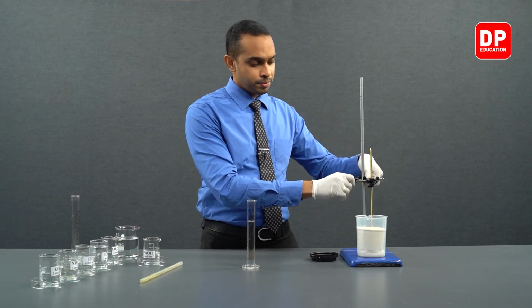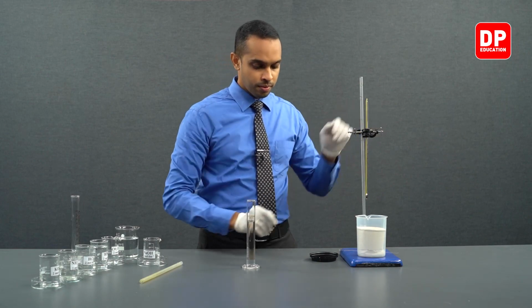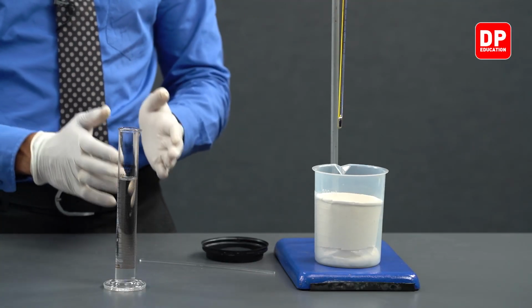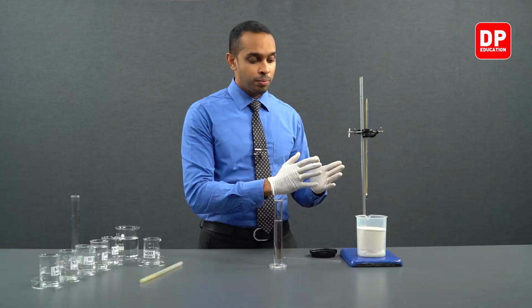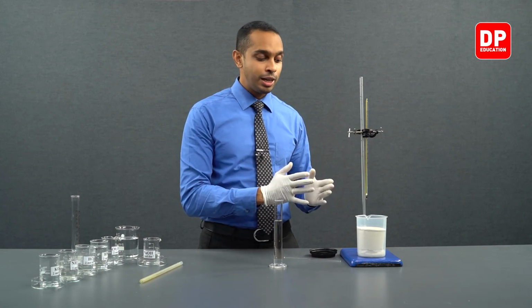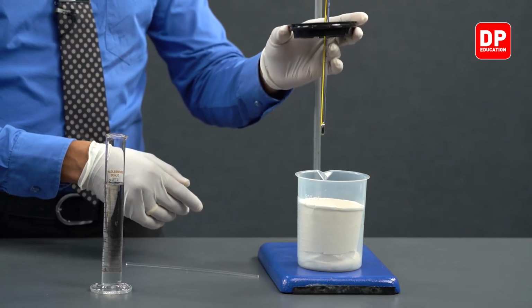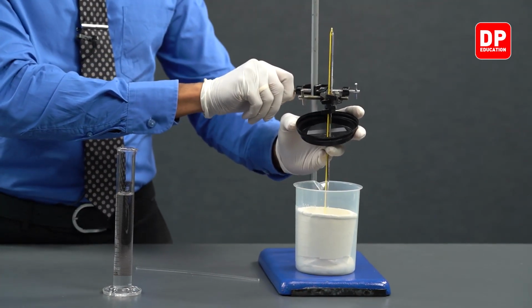We'll lift this thermometer out of the way, and we have to work fast at this point. We have to add our sodium hydroxide solution into this container, and as soon as we do that, we have to make sure that we close the lid and insert the thermometer into the reaction mixture to get a temperature reading. We'll place the lid like so, and we'll bring this thermometer down to the right level.